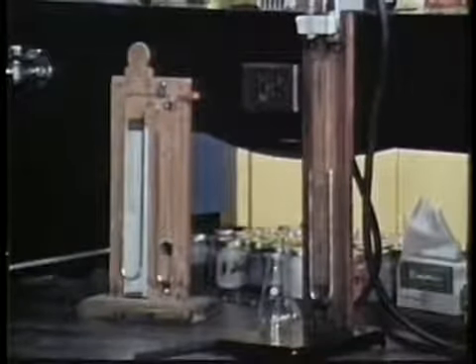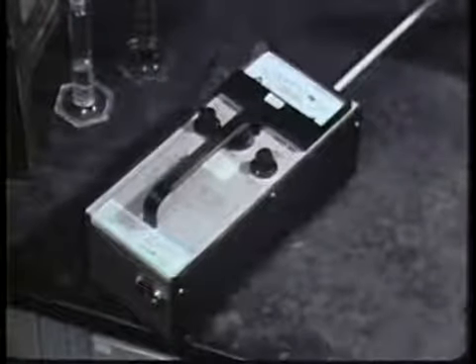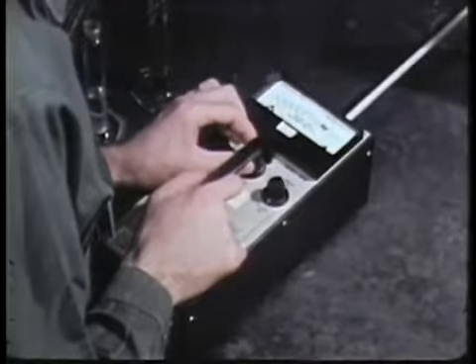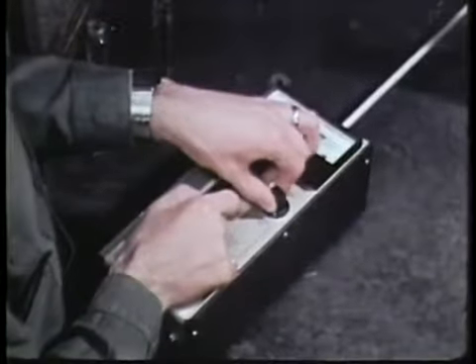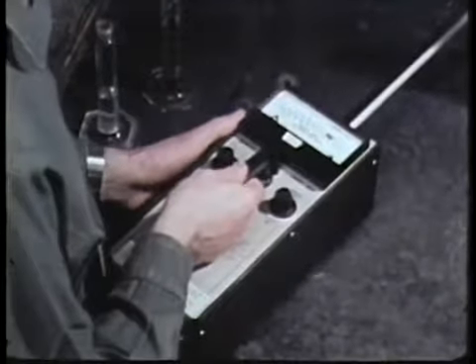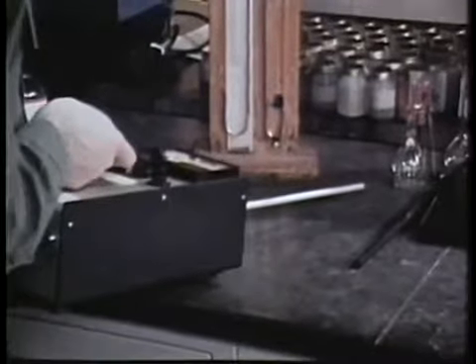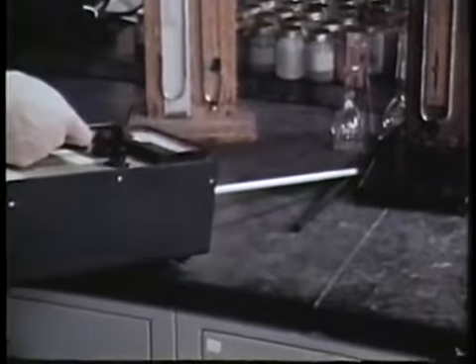Wherever mercury is used, a careful survey with the mercury vapor detector is very important. Allow 10 to 20 minutes warm-up time. With the detector on the 1.0 scale, recheck the zero adjustment before starting. Then shift to the ambient air position to begin your survey. Check specific work areas where mercury is used. Move the mercury vapor detector slowly and observe the meter for an upscale deflection.